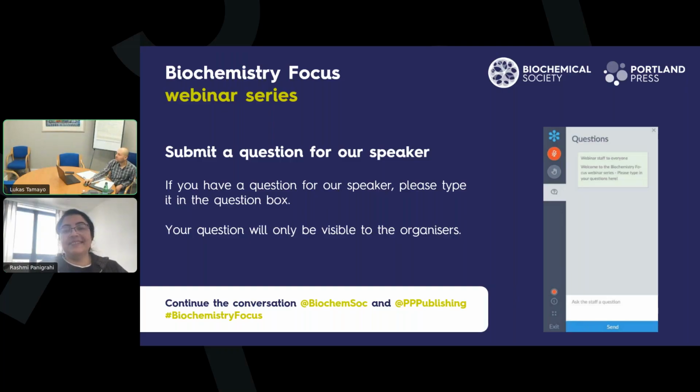So from Fruit Tower: H3K27 mutations would impact nucleosome wrapping or unwrapping. How do you think? Yeah.